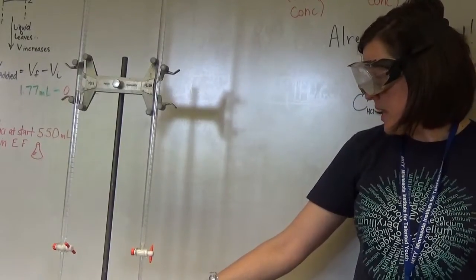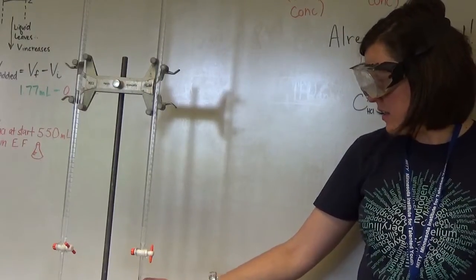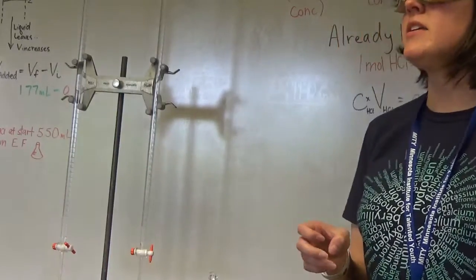Michelle. For the first one, since we don't have a lot of burettes for the acid, we just dump it out after we're done. Yep, you would put it in the waste and then you would start with the next one. Start us over. Exactly, yep.